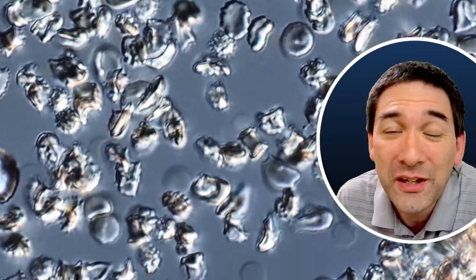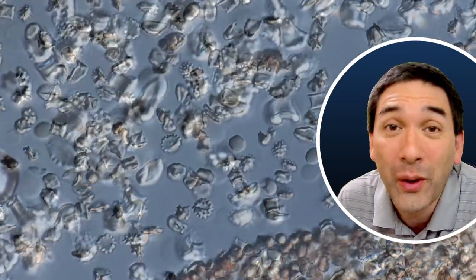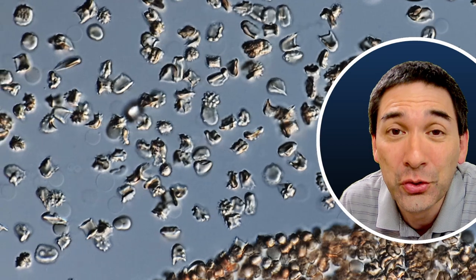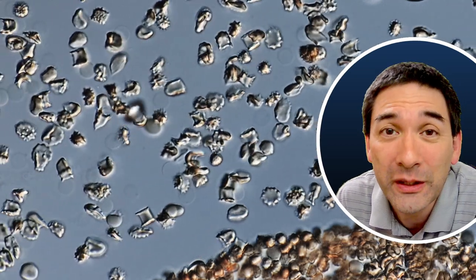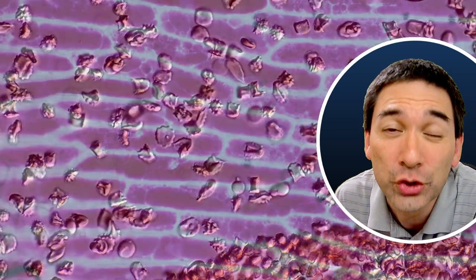Here a few weeks ago, these are red blood cells and they're quite badly deformed. And why is that? Well, because I added some salt water to my blood and this caused the red blood cells to lose quite a bit of water and caused them to shrink and shrivel up.